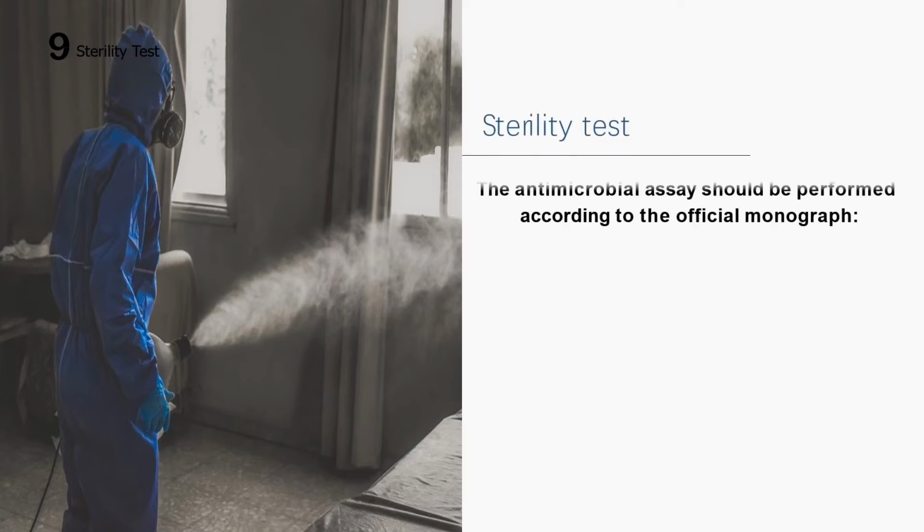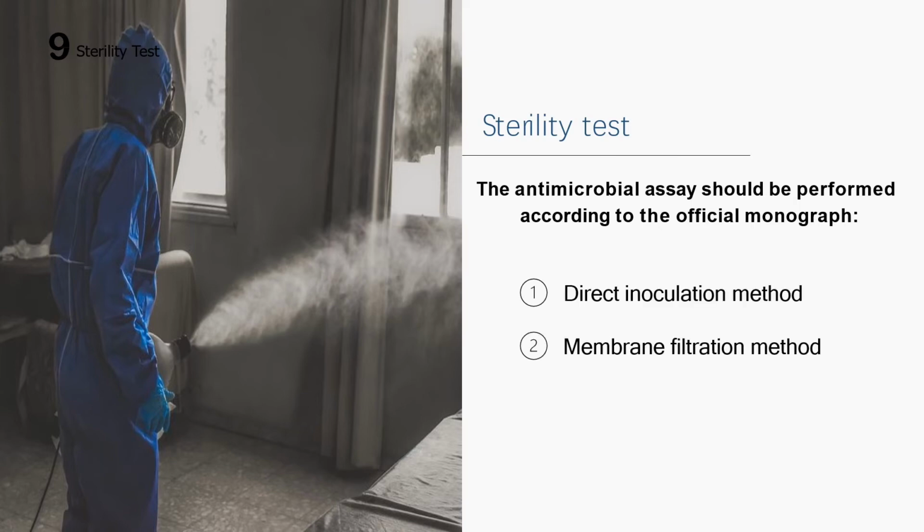The antimicrobial assay should be performed according to the official monograph: direct inoculation method and membrane filtration method.